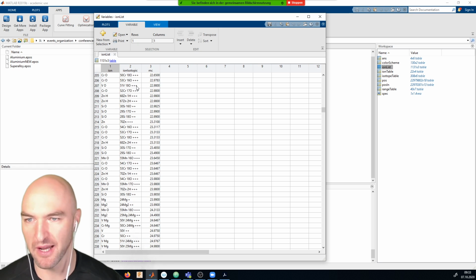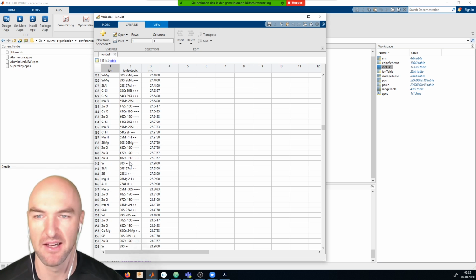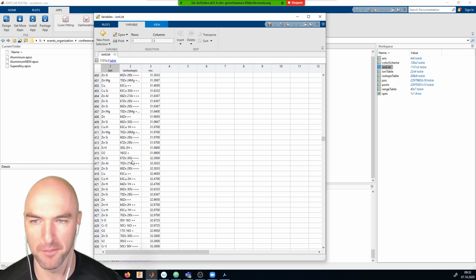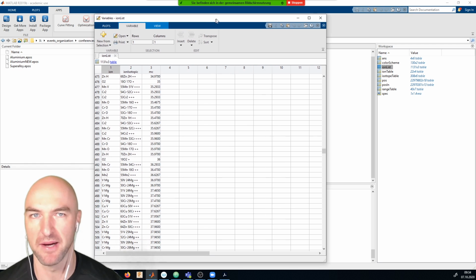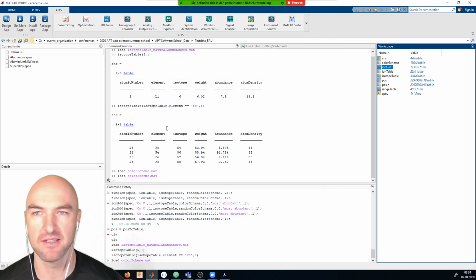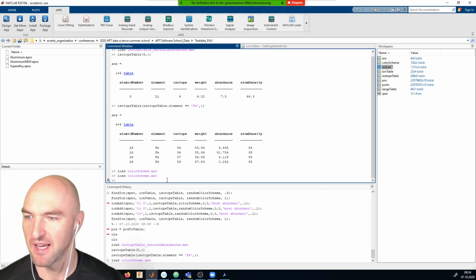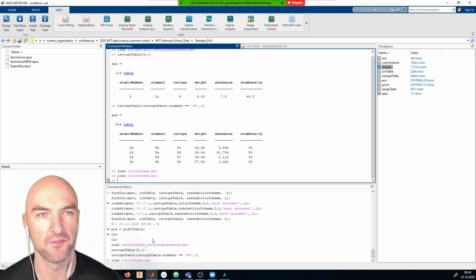But very often we go in unbiased and just say, okay, we have these elements in there, build me a list of all possible ions I could get from those, and then we can go through our mass spectrum and see if they're actually there or not. Great, so these are our ground truths, and these are essentially the basis that we work off of.